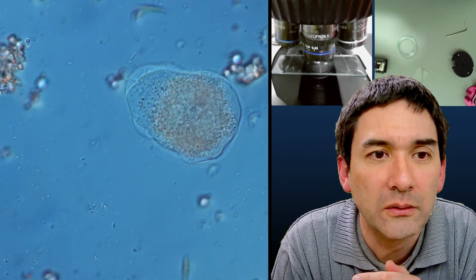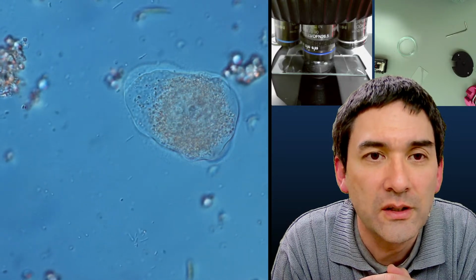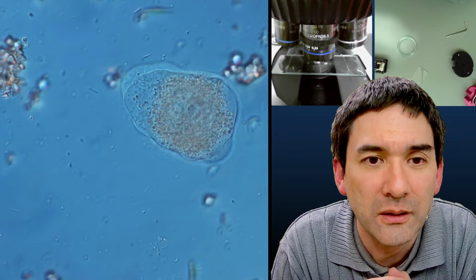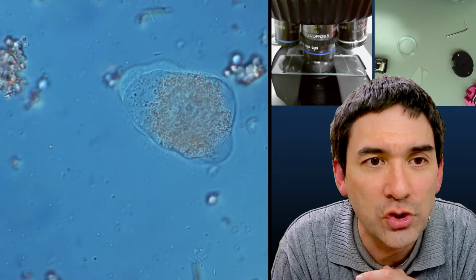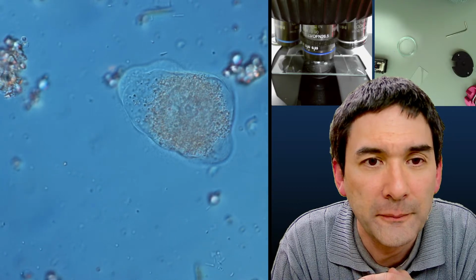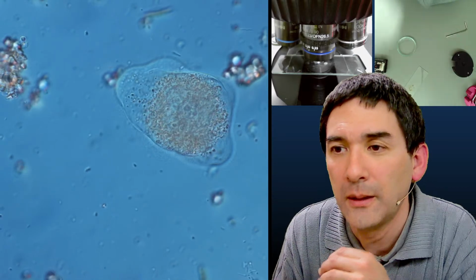I don't know. Could be some kind of an amoeba. Maybe it's a little bit stretched and stressed. Yeah, but it's most likely an amoeba because look, it's able to change its shape. But maybe it's still a little bit inhibited in its movement. Huh?